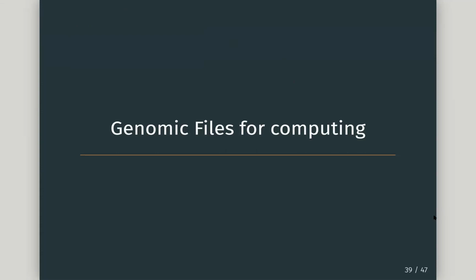Is the reference genome specific to a strain? Oh yeah, that's a really good question. Can I come back to that at the end, Abbas? That's a great question. It's actually a combination of strains, deliberately. If you go onto that page, NCBI, you can investigate and see what they've done to try and avoid the problem of having bias to one strain. Yeah, but a really good question. We'll hop on that page in the break.